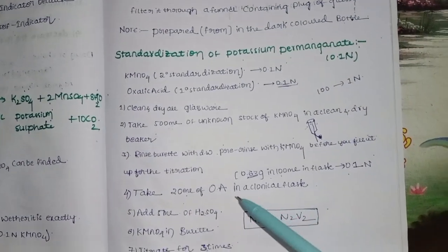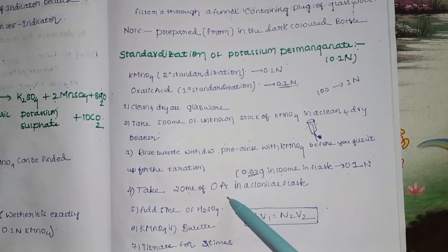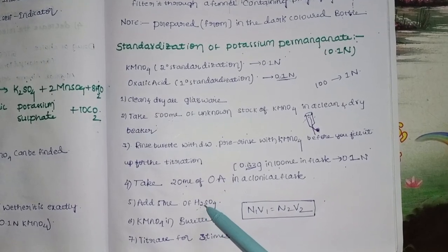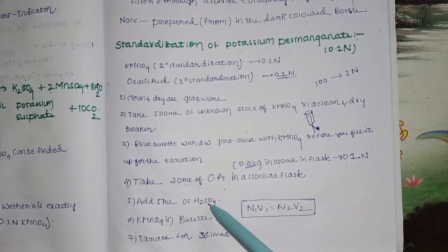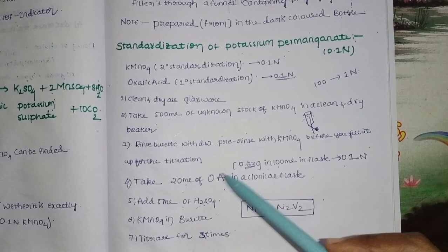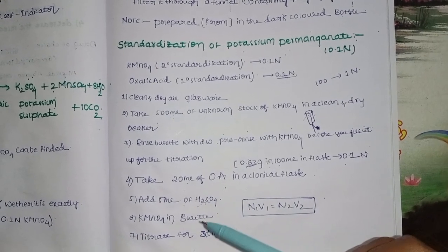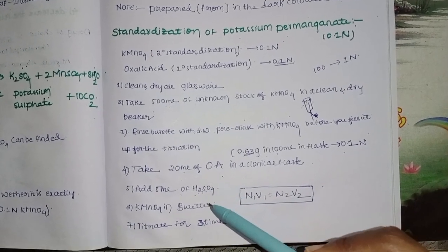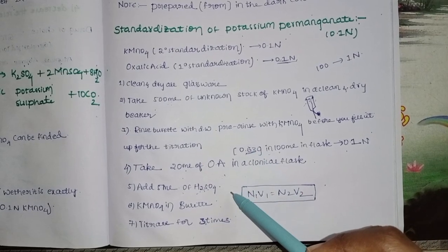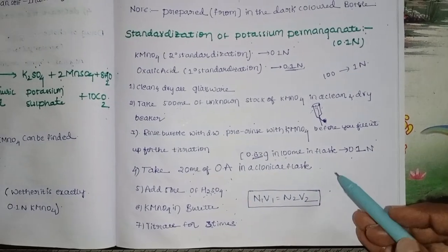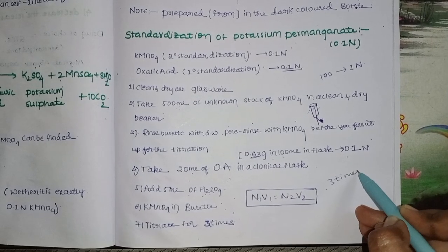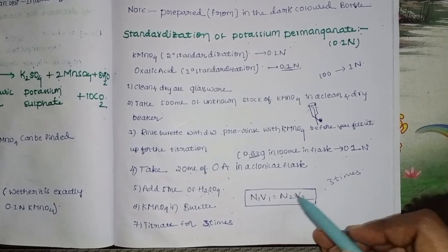Add 20 ml of oxalic acid into a conical flask, then add 5 ml of dilute sulfuric acid. Titrate the oxalic acid against KMnO4 from the burette. Repeat the titration three times and take the average volume.